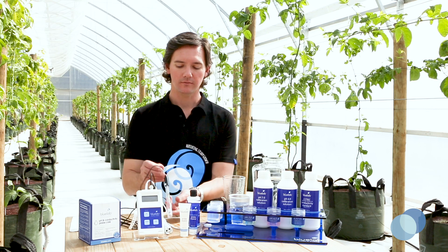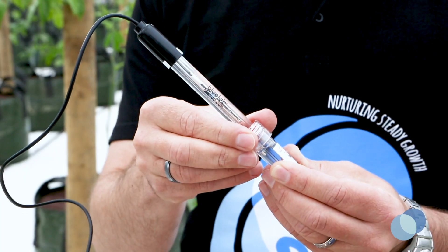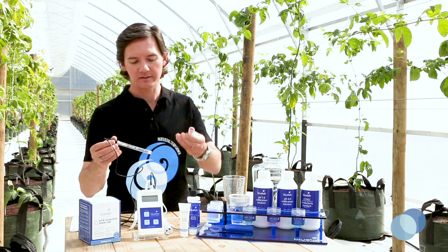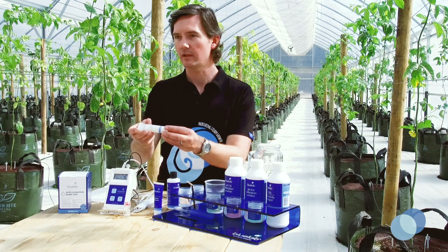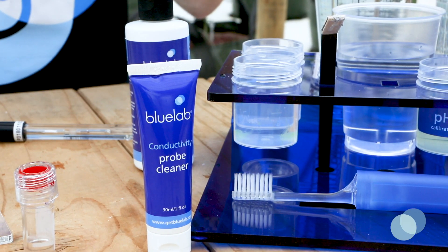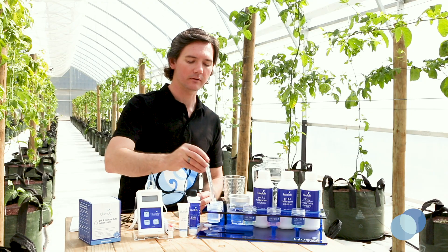Let's get started with cleaning the pH probe. First, turn the top of the storage cap counterclockwise to loosen it. Remove the storage cap and place it upright. Next, get a container with some fresh, clean tap water and put in a few drops of Bluelab pH Probe Cleaner. Gently stir the probe in the cleaning mixture.